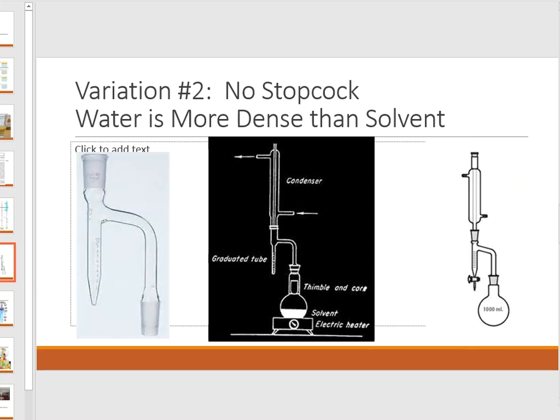So if I take a look at real pictures, what do these things look like? Well, here to the left is a Dean Stark apparatus. Notice that this one has no neck for a thermometer, all right? Over here to the right-hand side of that picture, this is where your boiling flask with sample would be attached. And the vapor would rise up, and it would go up this neck, and it would transfer over to the left-hand side, and this is your pointed area that looks like a burette there. So that burette-looking piece is what makes this very special, and that's your Dean Stark apparatus, right?